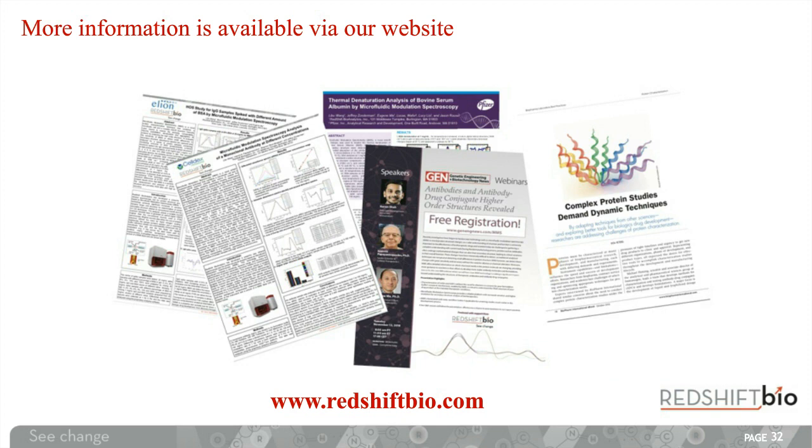Oh, yeah, also a very good question. Well, as one of the slides I presented might have shown you, we think microfluidic modulation spectroscopy, with its very broad concentration range and its ability to measure in a very wide range of backgrounds, is a very suitable technique for a number of different applications, particularly in that we can compare directly between samples in very simple backgrounds and perhaps at low concentration with those at much higher concentrations and much more complex backgrounds. But there are many applications that we can apply this technology to.